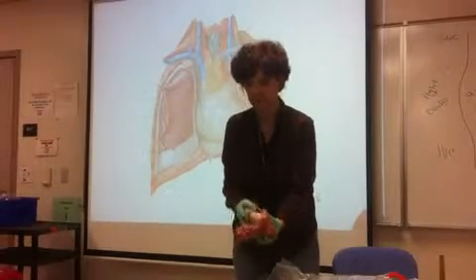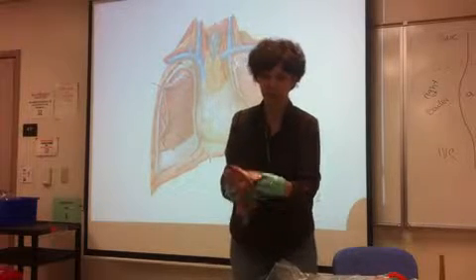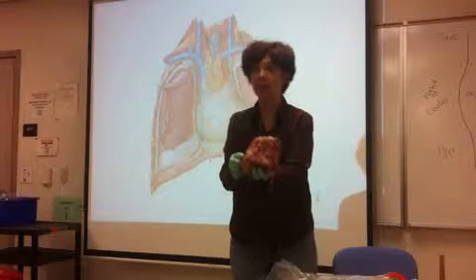I think when they're little. They're lamb hearts. Yeah, they're lamb hearts. Oh, so this is actually huge, it's almost like a cow heart. But this is the pericardium.